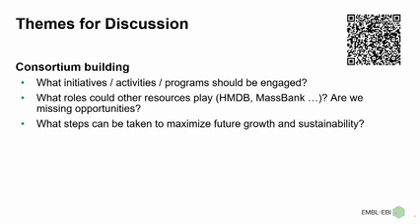Yeah, about the reference materials, I think when doing untargeted work you also need to be careful how you're processing and aligning your data, as you could put your thumb on the scale, so to speak, and have an annotation from your reference material that is then maybe gap-filled, which I think is quite standard in data processing algorithms, where all of a sudden you're seeing annotations that are actually from your reference material and not from your samples themselves.